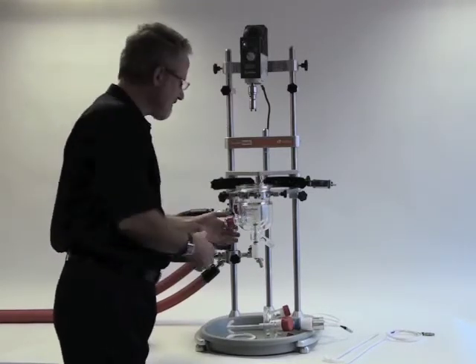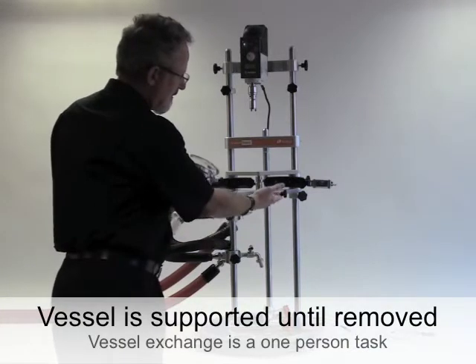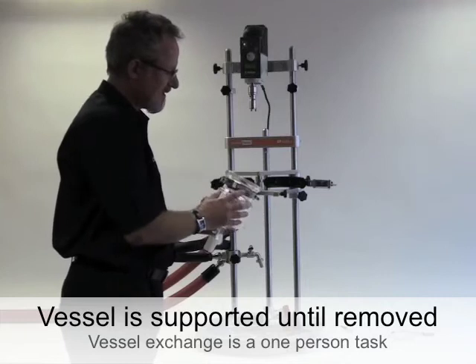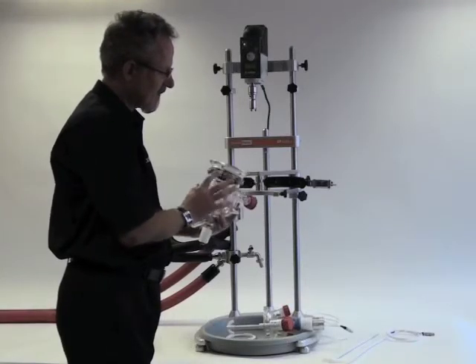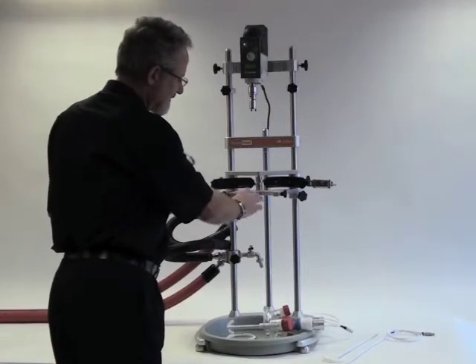The flat flange makes it much easier to obtain a very good lid seal. Now I can remove the vessel. The vessel is supported in the frame by this stainless steel support collar which has three lugs, and these locate in the recesses in the support.